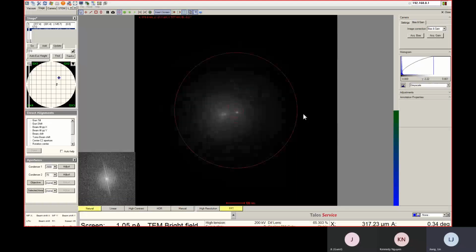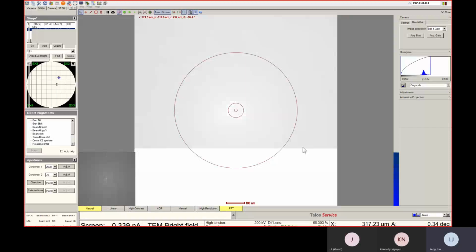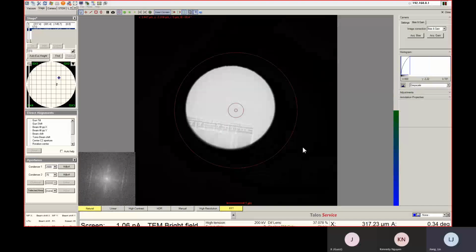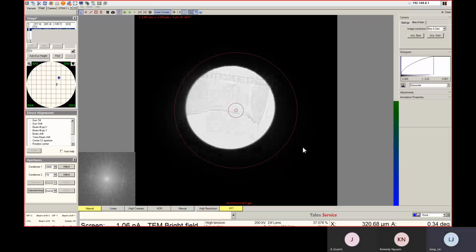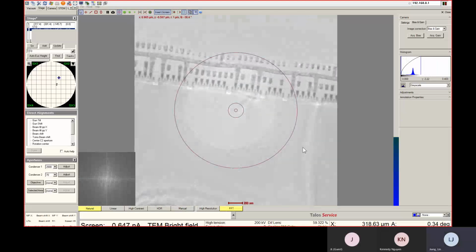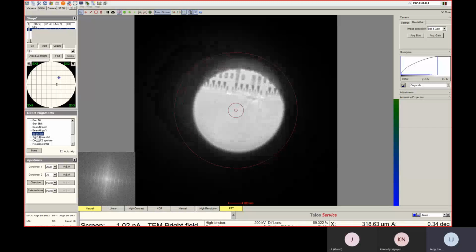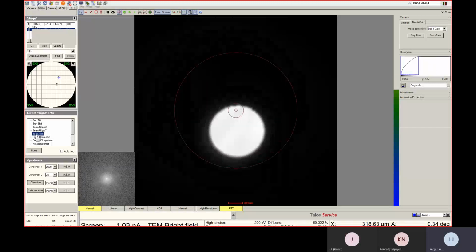You have to check whether you're on the sample or not, because when you do beta tilting, you introduce a lot of side movement. You're not on the sample. Basically, you need to go back. And then we condense the beam, select the location, go here.